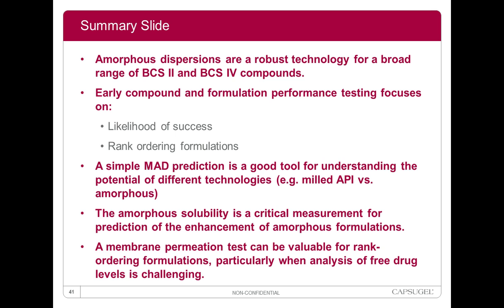So on the technical side here, again, amorphous dispersions are a very robust technology for a range of compounds. In early compound formulation, it's important for us to look at all the physiochemical properties of a compound and to use some fairly simple tests to try and rank order possible formulations and understand the likelihood of success for any formulation strategy we might select.